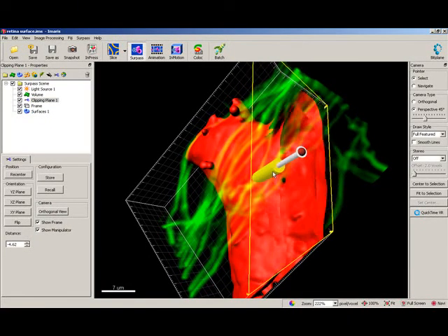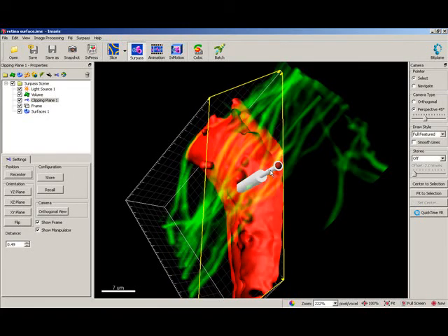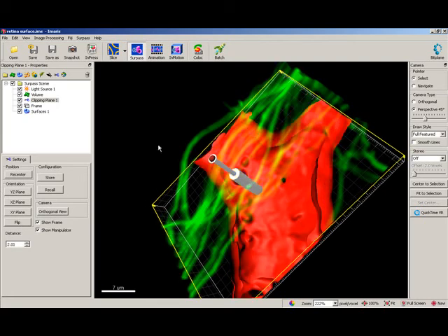Lastly, Imaris allows multiple clipping planes, providing yet another effective way to generate the best presentation of your datasets. The clipping plane or planes can be used in combination with both the ortho slicer and/or the oblique slicer to further improve the visualization of complex datasets.